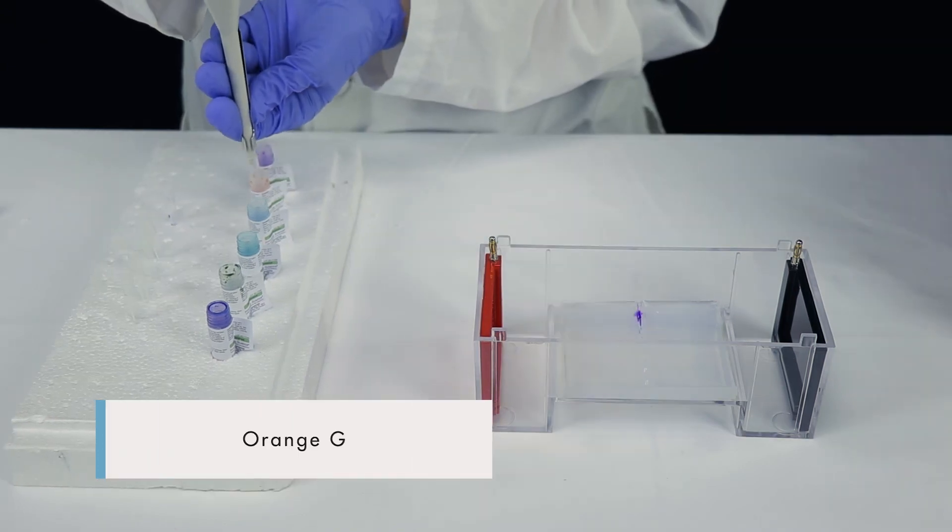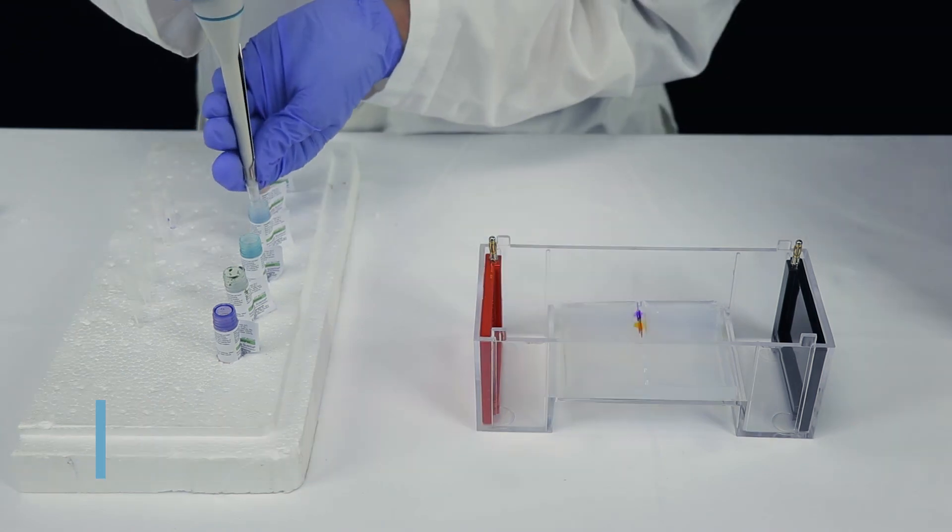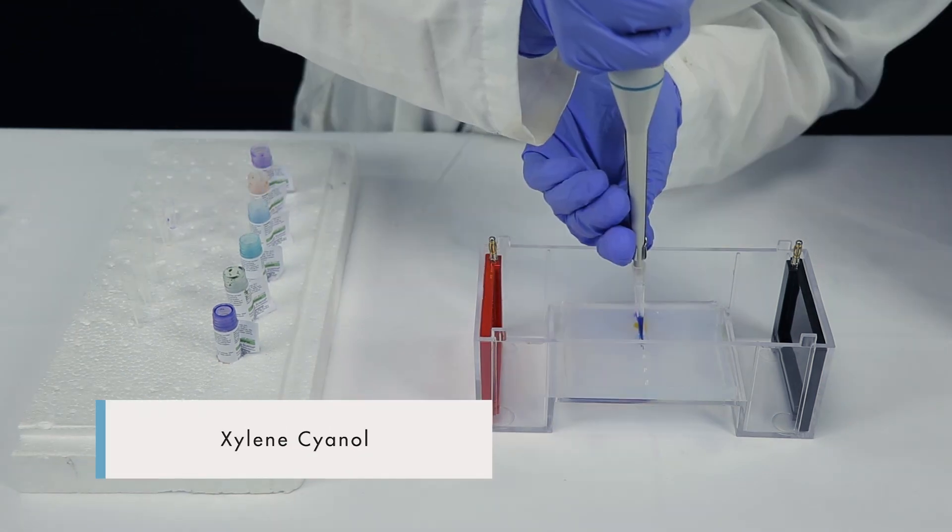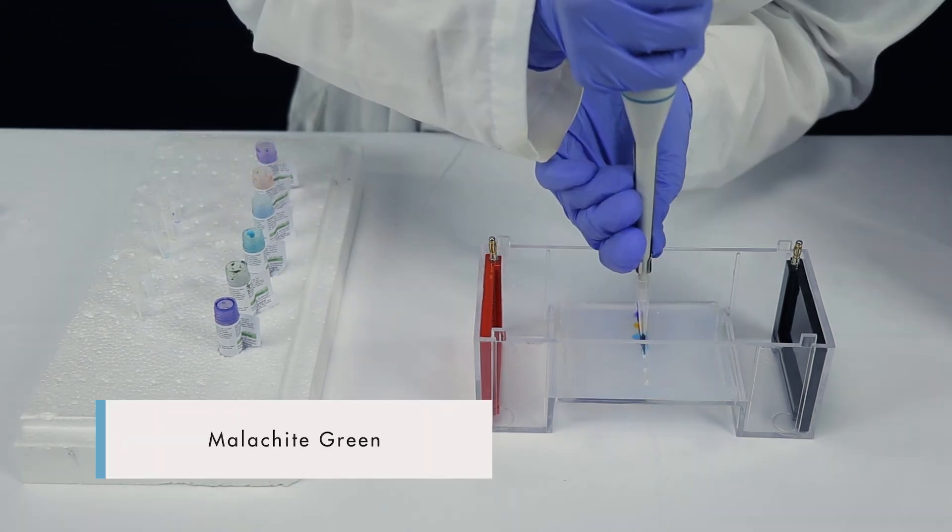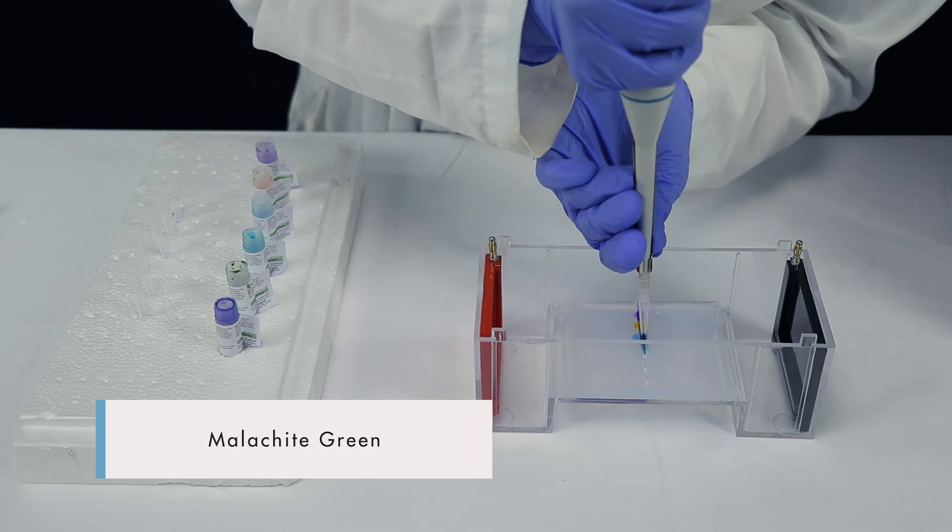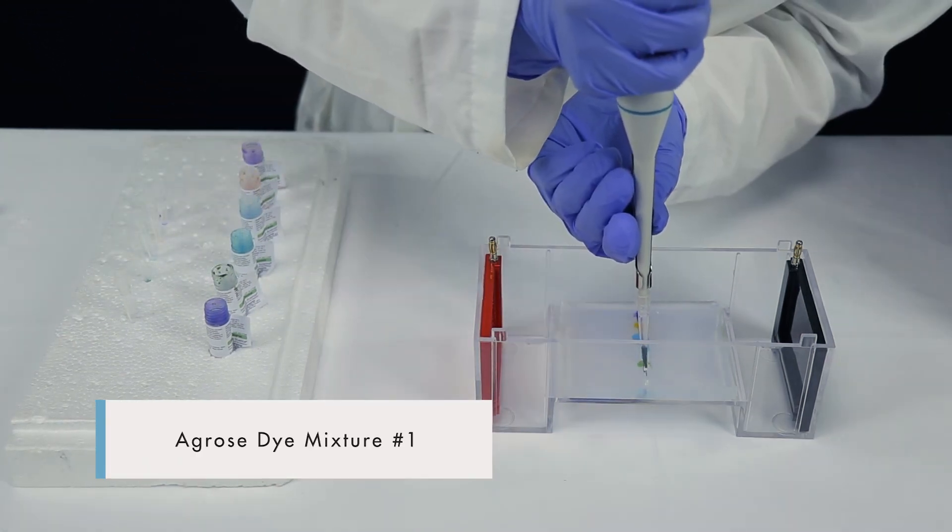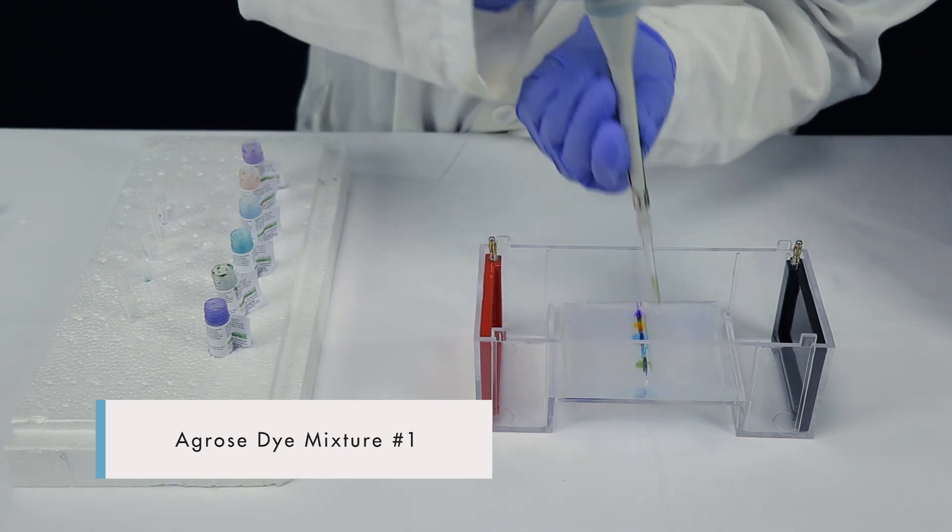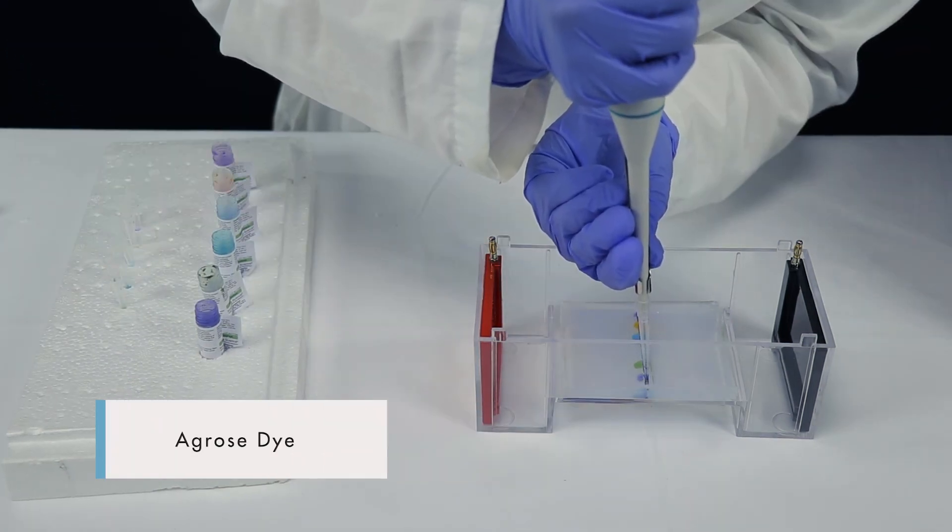These dyes are of different molecular sizes and carry different charges. Because of this, we'll load the dyes into wells positioned in the middle of the gel. Some of the dyes will be attracted to the negative electrode and others will move toward the positive electrode. However, if you're separating DNA, always position the wells at one end of the gel. Record which dye was placed into each well so you can compare your results later.